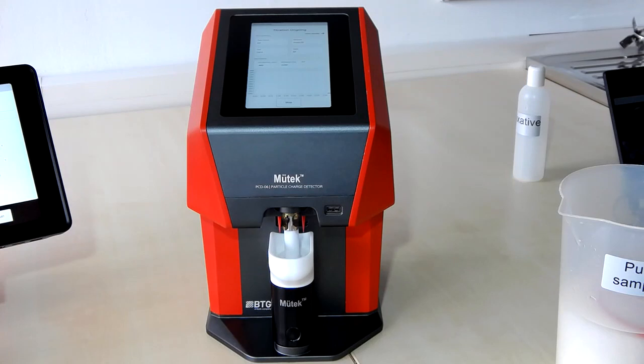So, and I'm starting the process now. The PCD06 can do dynamic sorts of titration, which means it has some intelligence to respond to the signal changes. If the millivolt signal after an injection changes very rapidly, for the next step the PCD would reduce the dosage. And vice versa, if there is barely any millivolt change after titration injections, it will just speed up and increase the dosages.